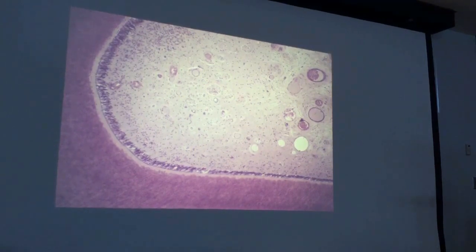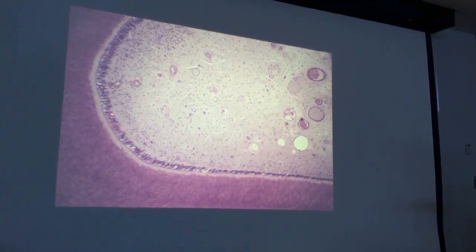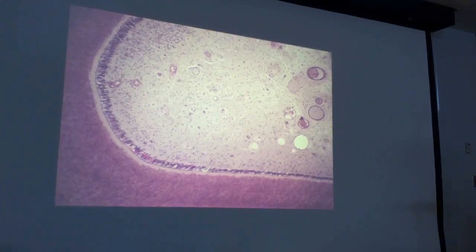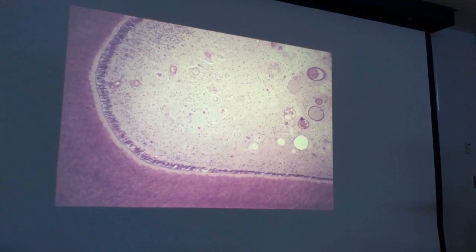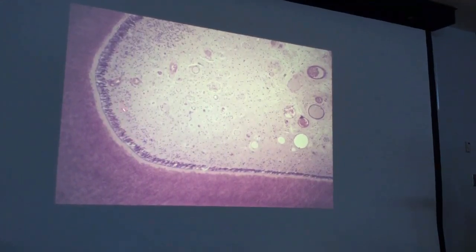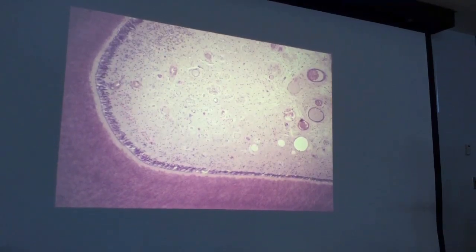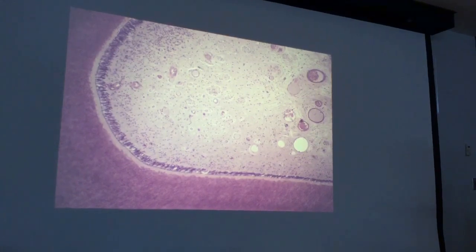And how about that right there? Nerve in cross section. What are these cells we see right there? Odontoblasts. Fair game for this test since this is part of the pulp. And how about that area we see right there? Cell-free zone. This would be the cell-rich zone, oftentimes not found in the textbooks. Okay, so we've got the pulp there.